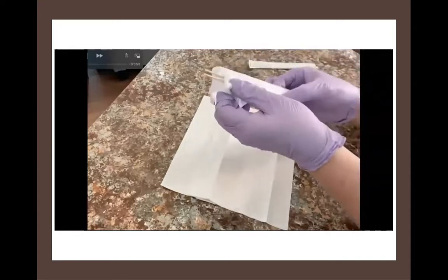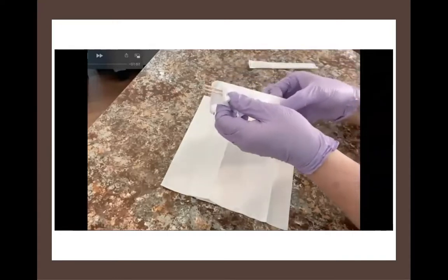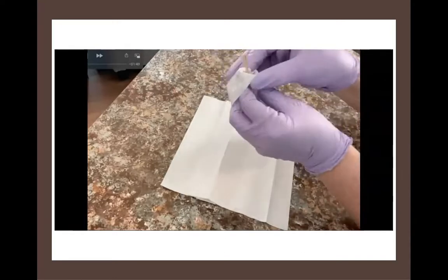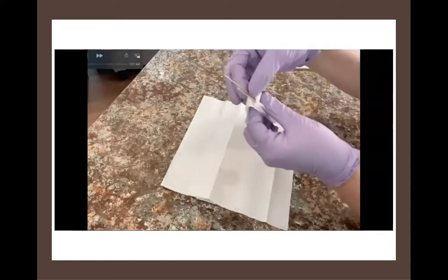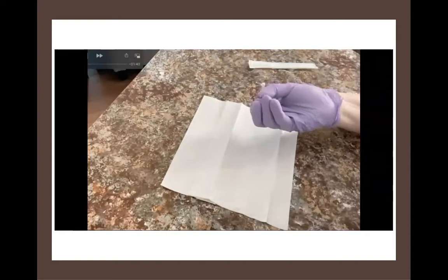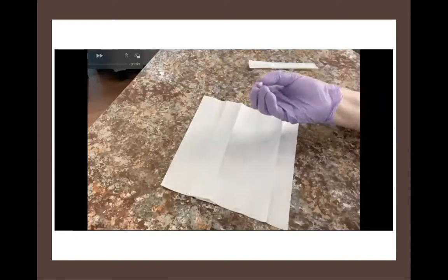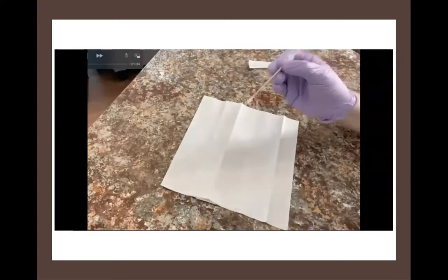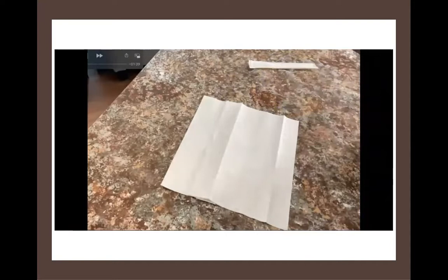So if you carefully manipulate the package here so that the opening is a little bit wider, you can pull the swab out carefully and you've got a nice sterile surface. So you can take culture material up with a cotton swab and use it the way you would use an inoculating loop. When you're done, you can simply toss that swab in the trash.